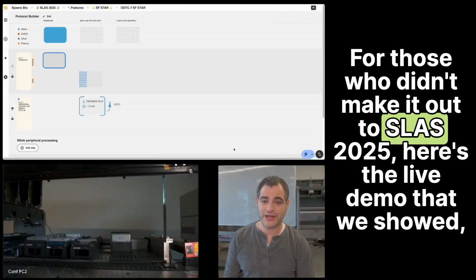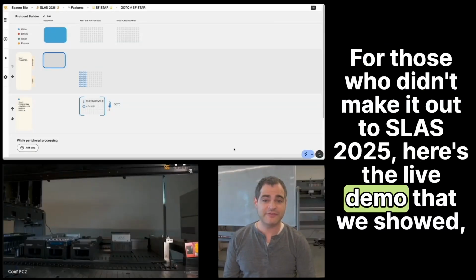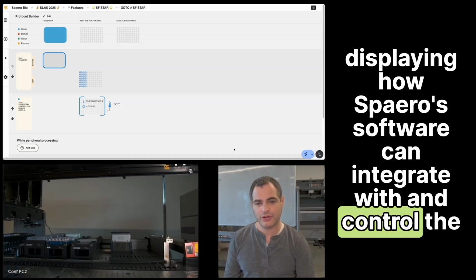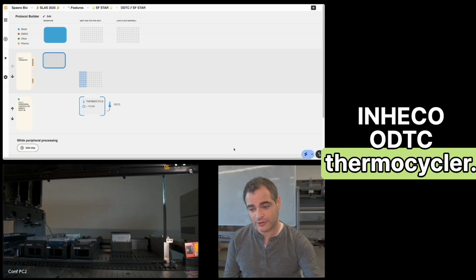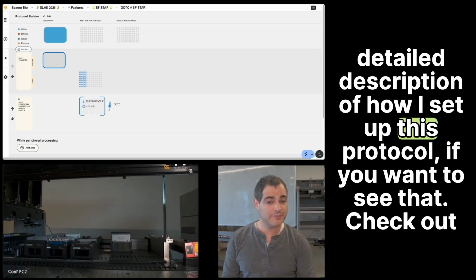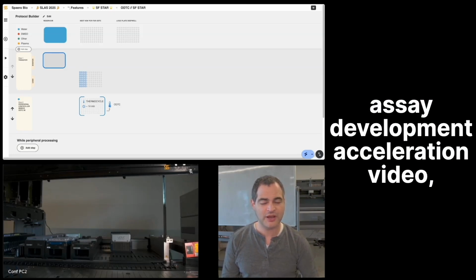For those who didn't make it out to SLAS 2025, here's the live demo that we showed, displaying how Spaero software can integrate with and control the Inheco ODTC thermocycler. We're going to skip through the detailed description of how I set up this protocol. If you want to see that, check out our assay development acceleration video in the link above.